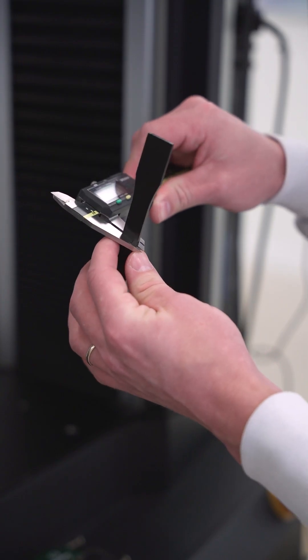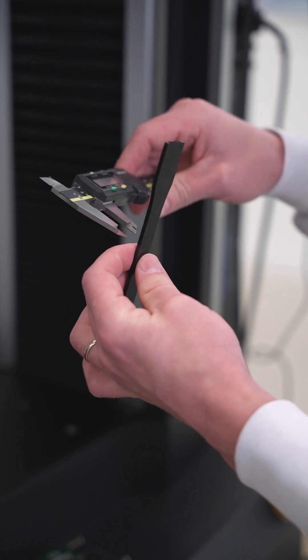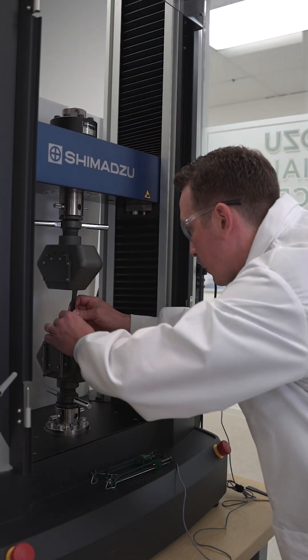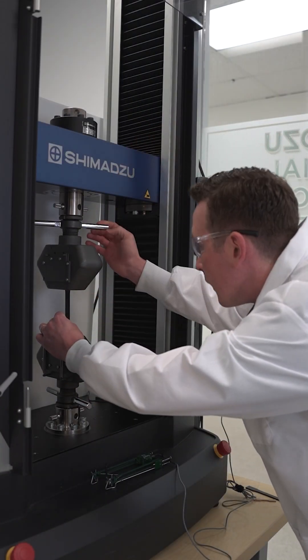The procedure involves measuring the specimen's dimensions, mounting it in the grips, and aligning it vertically.